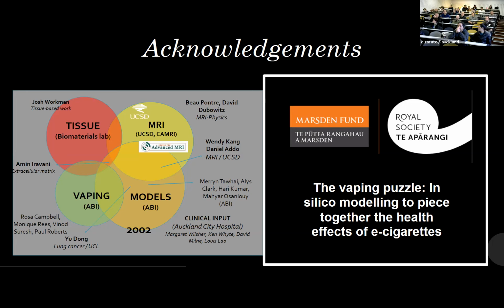And for the formaldehyde, I assume you try to spike it just to confirm that the method's actually working. We are still developing that method. We're running standards of formaldehyde at the moment and trying to see if we can quantify it. But at the moment I don't know. I think it's in such very low concentrations in the e-liquids, and it's so volatile, so we're trying different techniques.